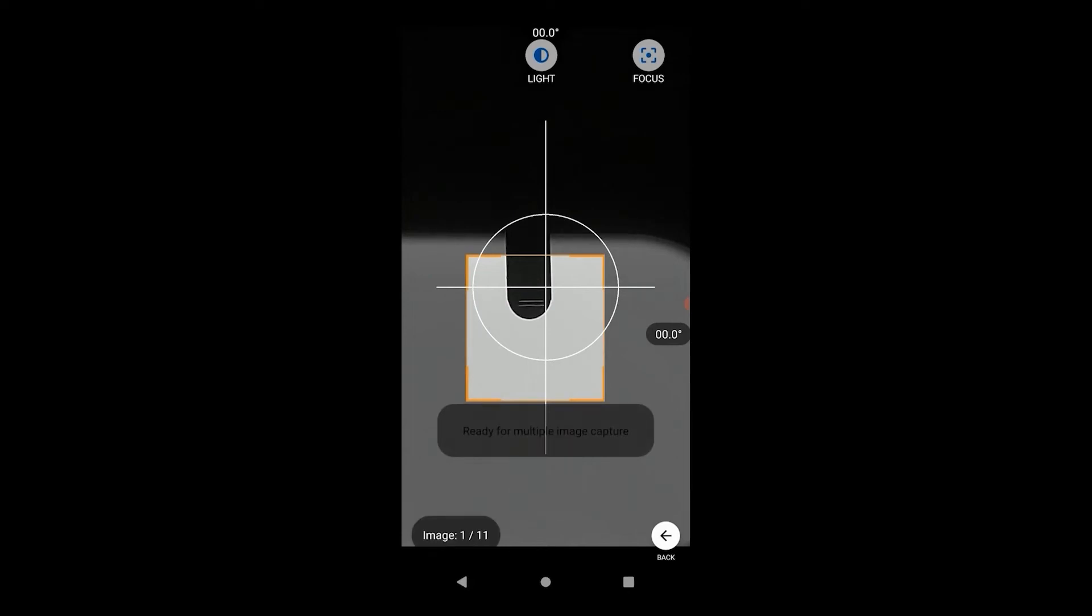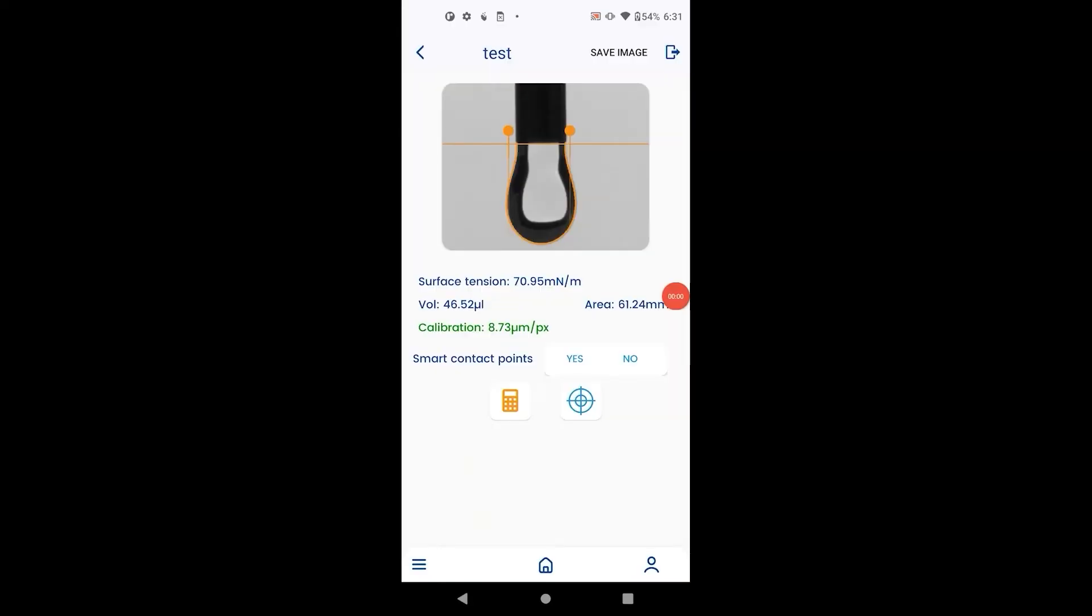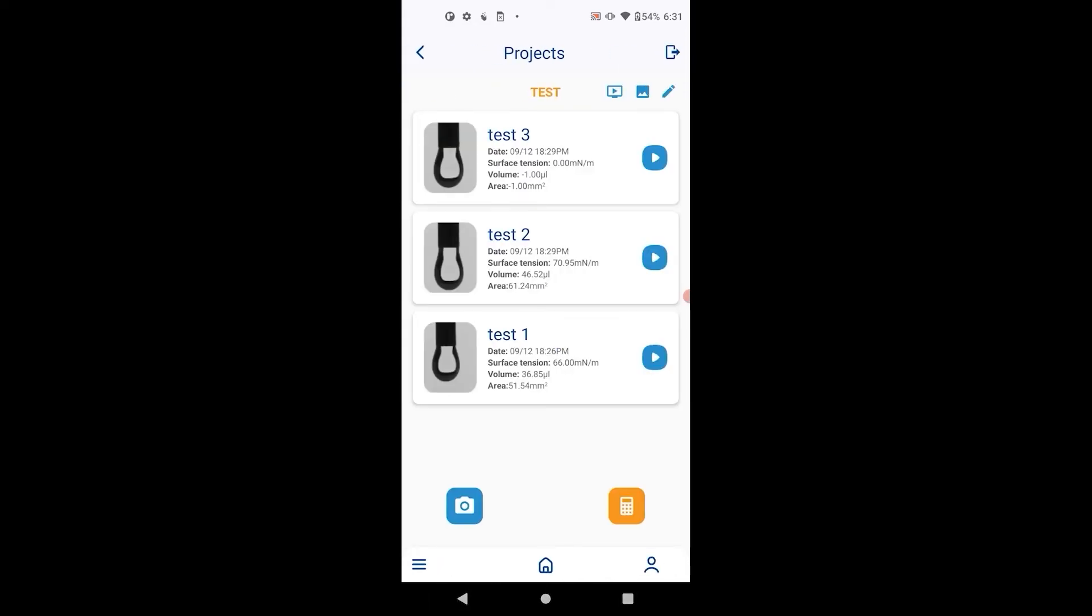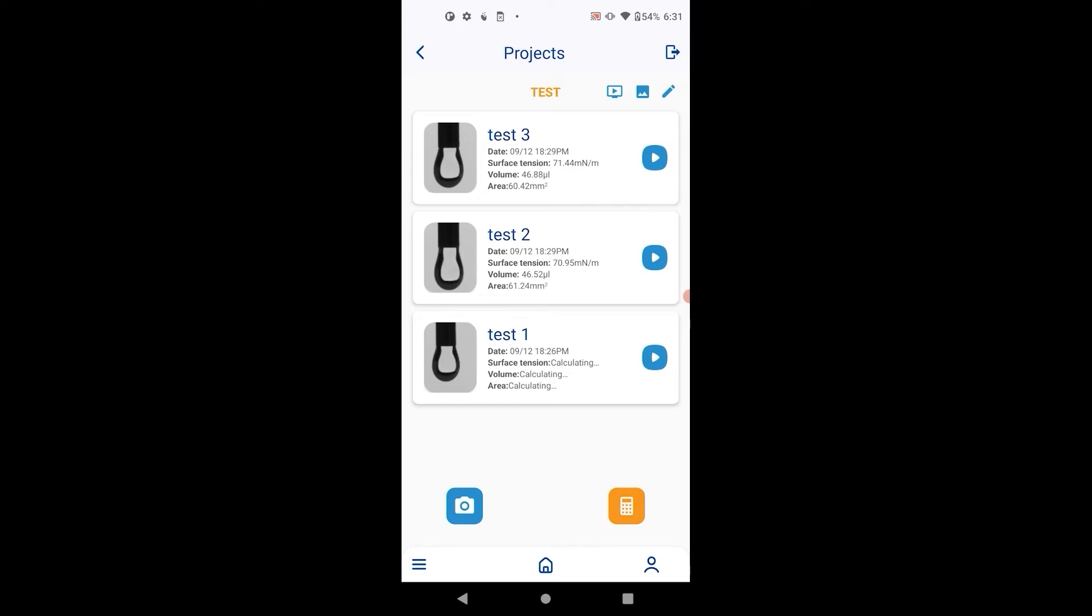Go to one of the images. Do the entire calculation process including calibration. Then go back and hit calculate all to process all the images captured in this timeframe.